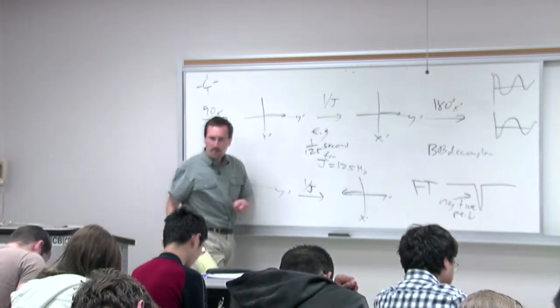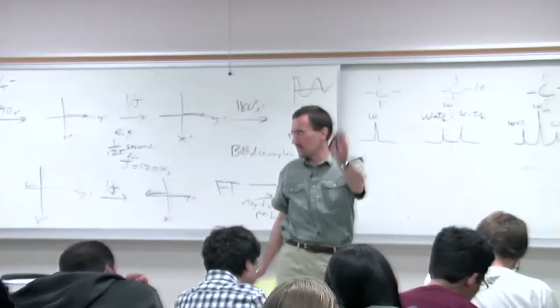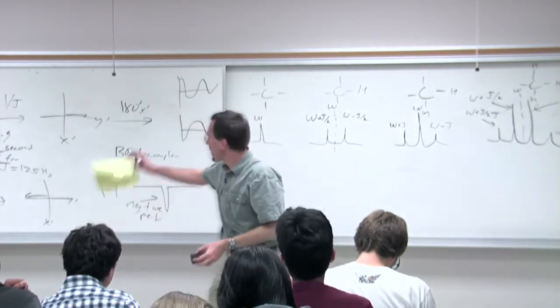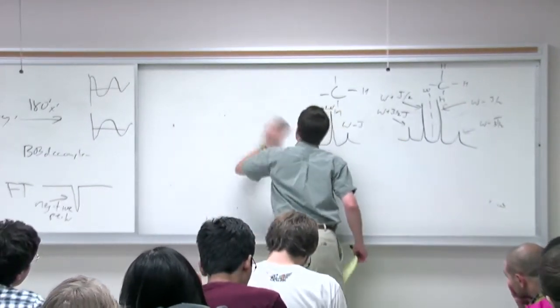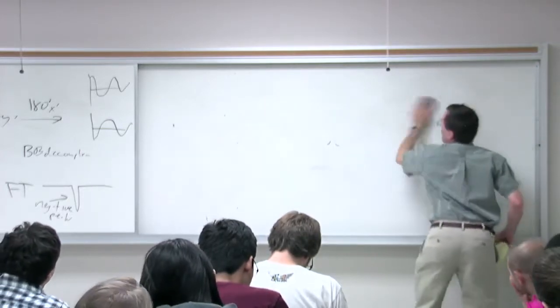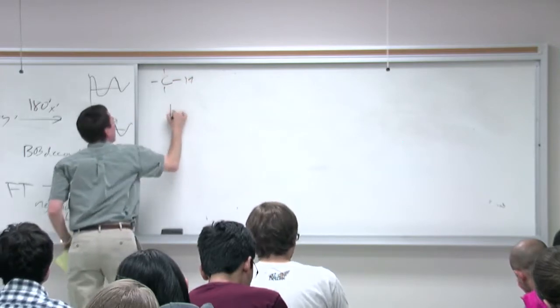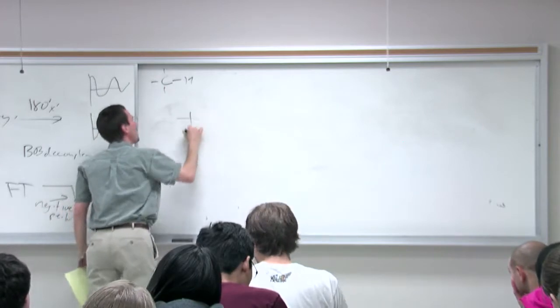All right. Remember, the APT is going to be distinguishing our methynes and our methyls from our quats and methylenes. So now let's try this exact same scenario, but we're going to try it with a methine. All right. So now, I'll just write things out exactly the same way.